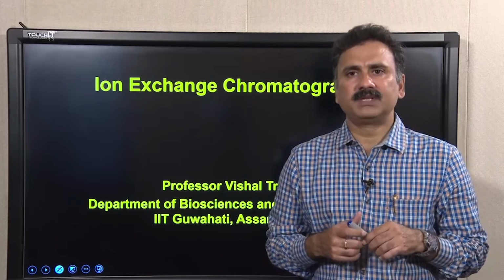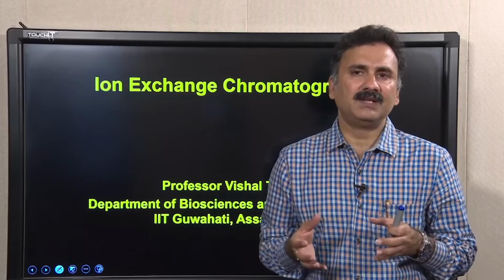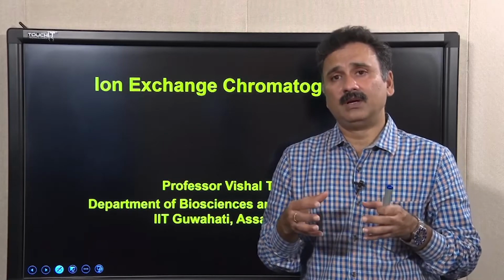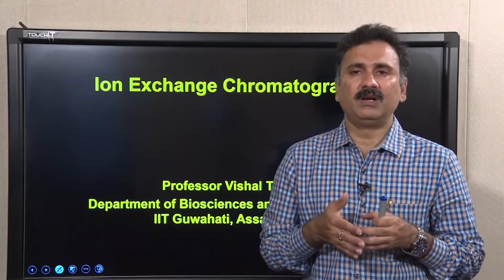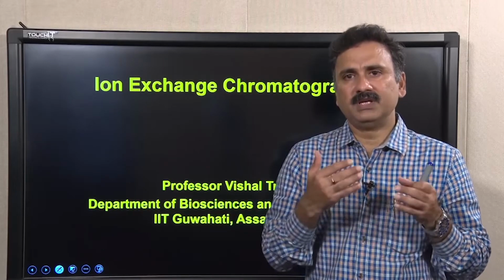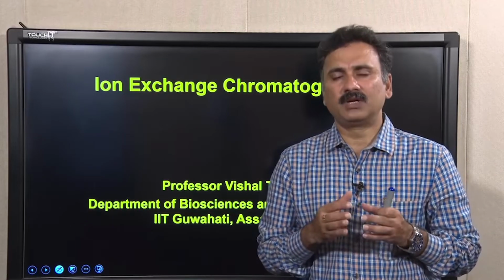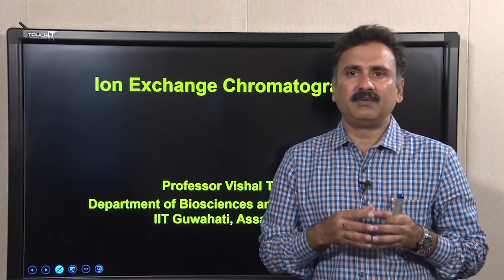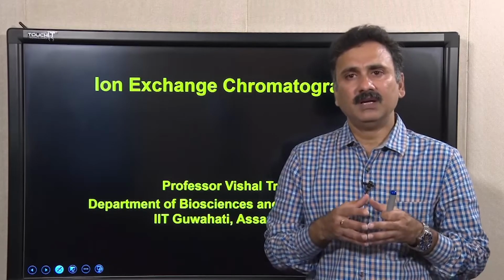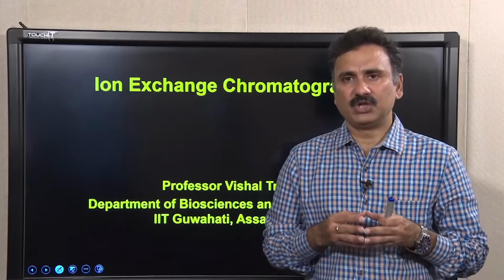addition, we have also discussed how to perform generalized ion exchange chromatography, what the different steps are that you have to take to successfully complete the chromatography, how to choose the different types of matrix, what is the importance of isoelectric point, as well as the other parameters which you have to consider while you select the suitable matrix for protein purifications.